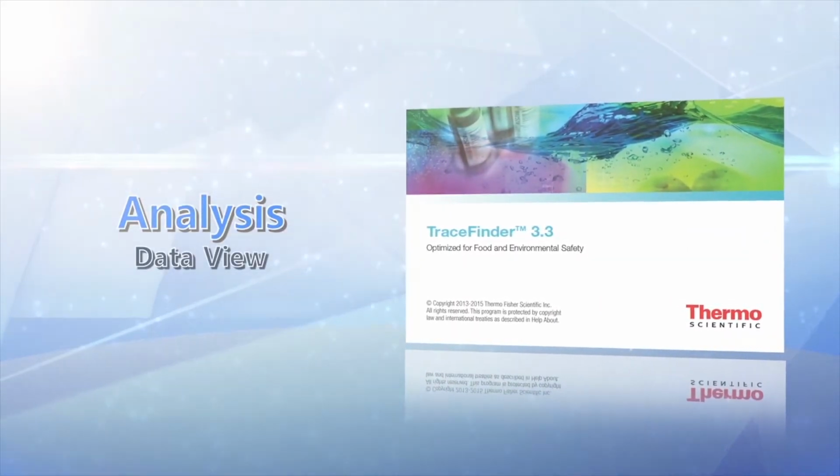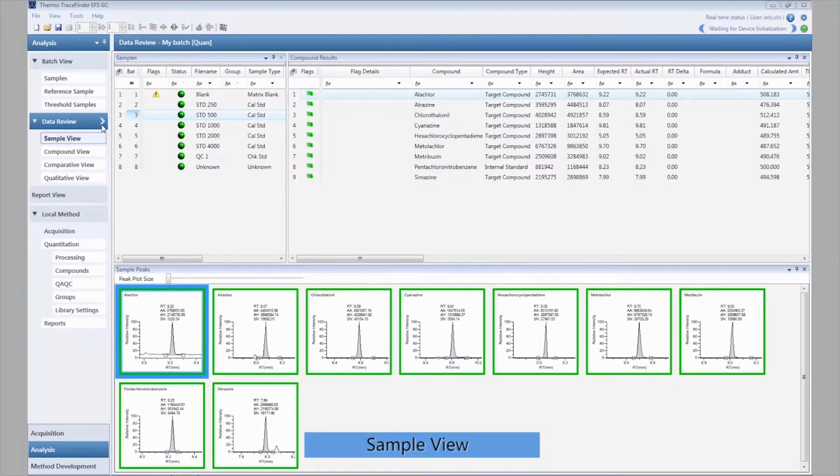Data View. There are two ways to represent detailed results on the screen. One is called Sample View, and the other one is called Compounds View. Sample View.